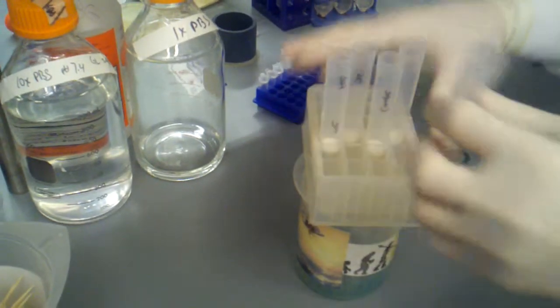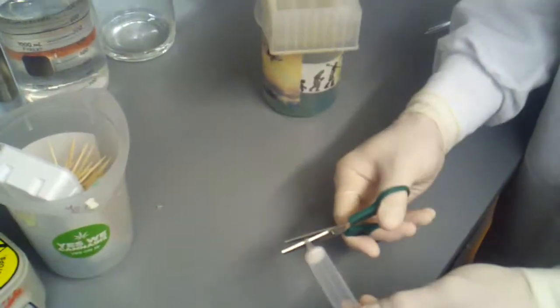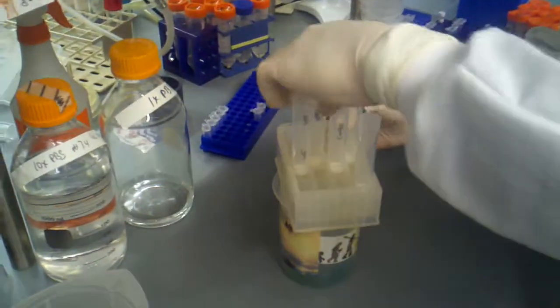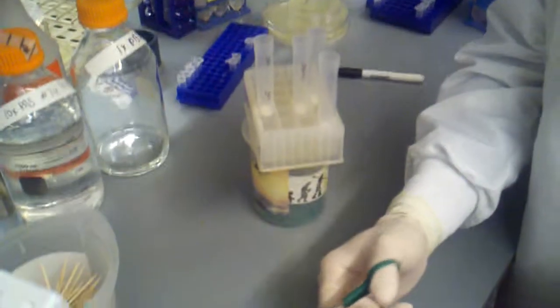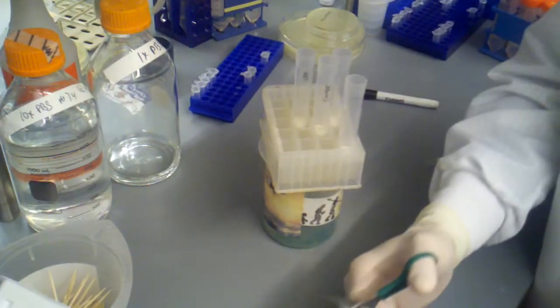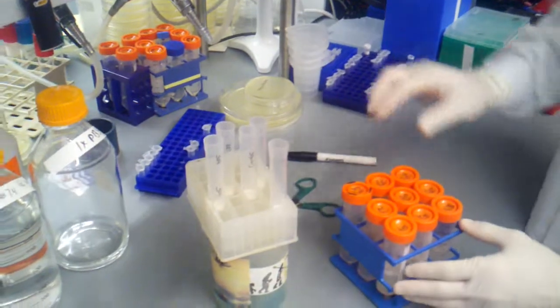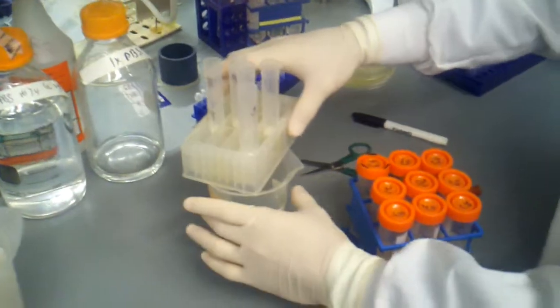I actually realize now that I forgot to chop off the bottoms of my tubes, so I'll just do that real quick. The reason you want to do this is so that it has enough of an opening so that the flow comes out fast enough and you're not waiting around forever for your liquid to flow through. Now that that's good to go, all I've got to do is make sure that my samples match up with what is what.